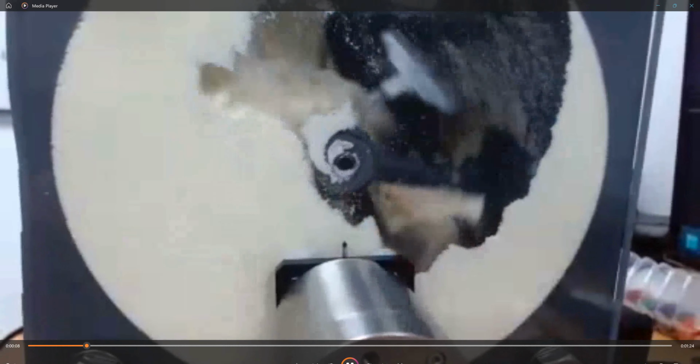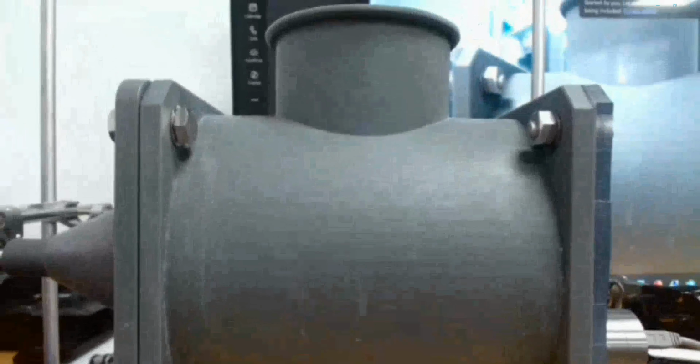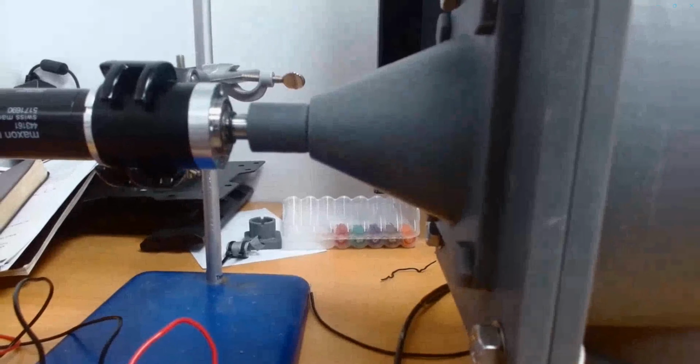Okay, so what we've got here is a generic plowshare blender that we have 3D printed out of resin. It's got an inlet chute at the top, and an outlet valve at the bottom. On the back end here, we've just got a motor connected to a shaft that is linked to all of the paddles, and at the back, the exit valve is controlled by another stepper motor. Inside you've got 4 paddles, each at opposing angles, and you can see the NIR just at the top there.